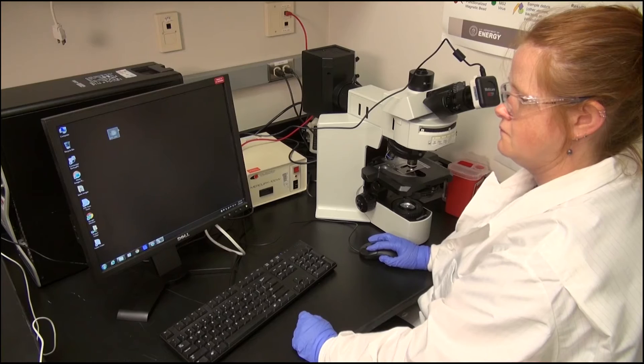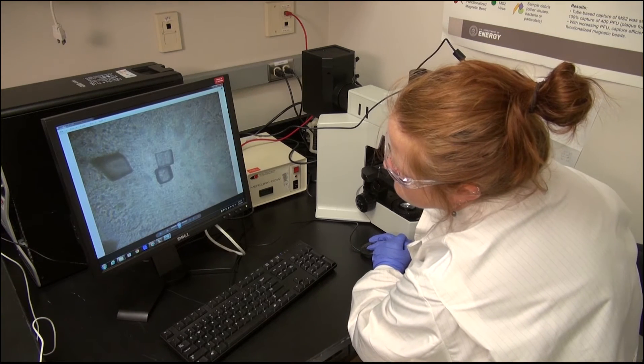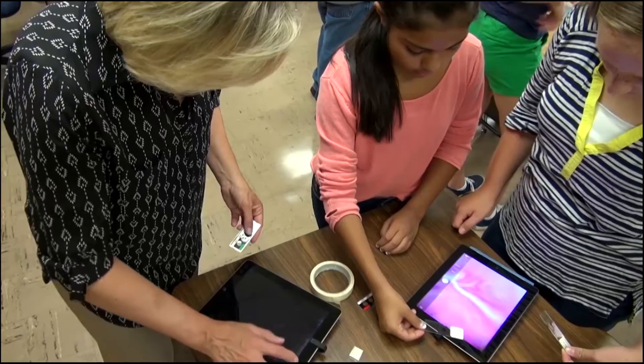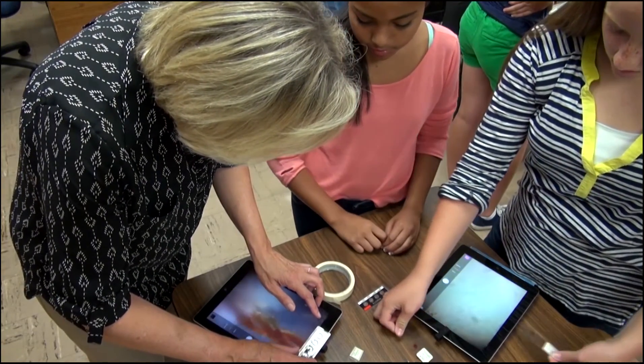The image could then be sent to a trained microbiologist sitting in a lab across the country. It would allow decisions in the field to be made more quickly, and at the other end of the spectrum, be a great tool to inspire students' interest in science.